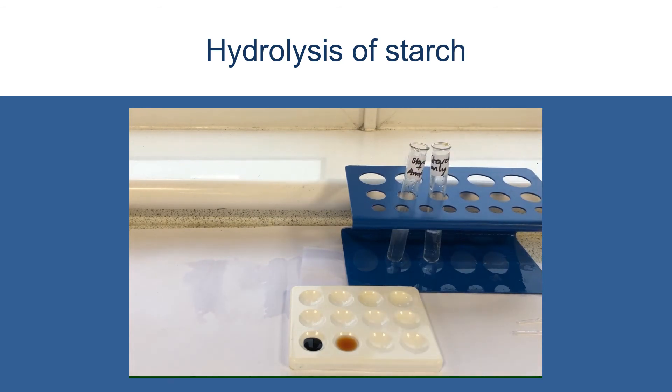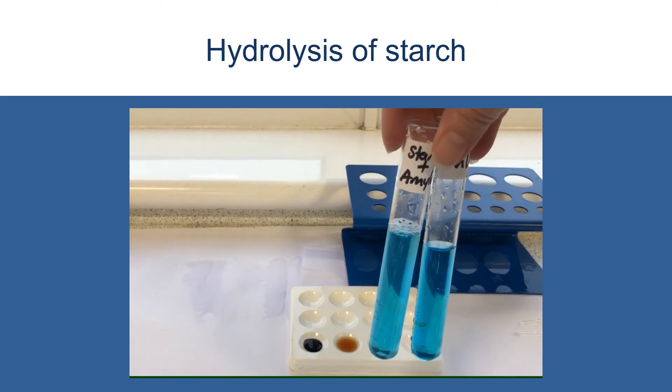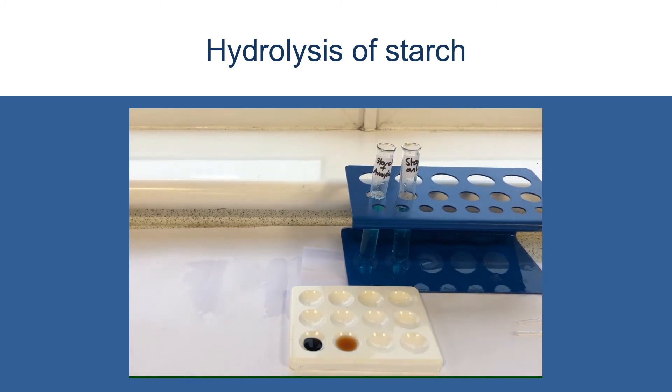And then we would put it in our water bath at 90 degrees C to check for any colour changes with our Benedict's. So you can see that before it goes into the water bath, both of our test tubes remain blue.